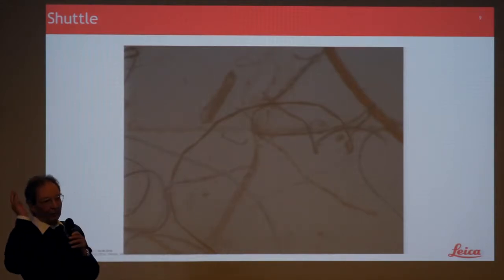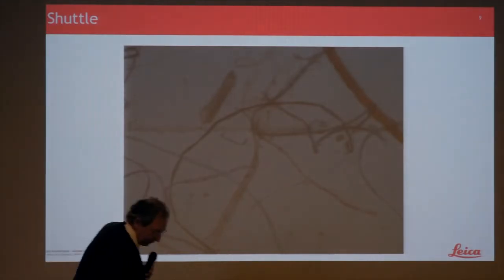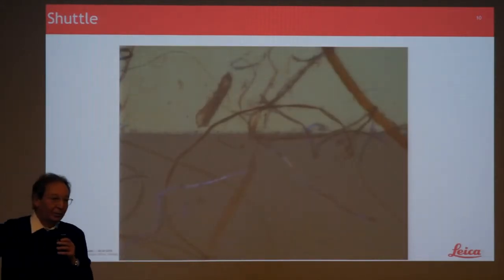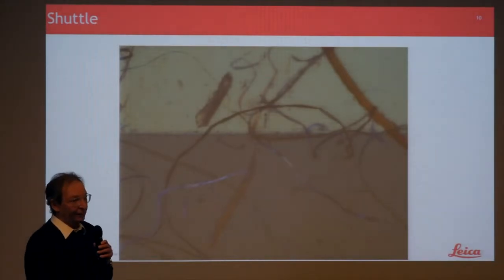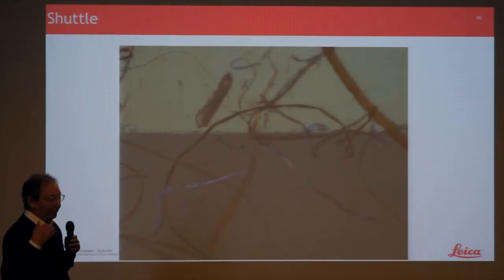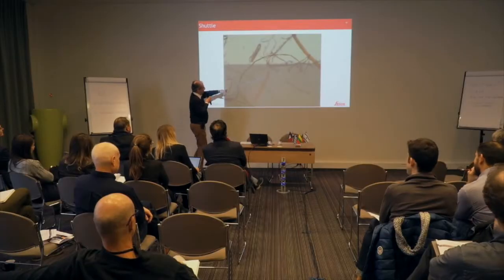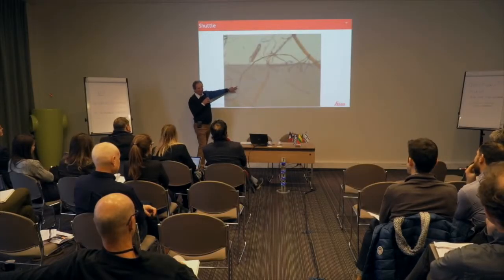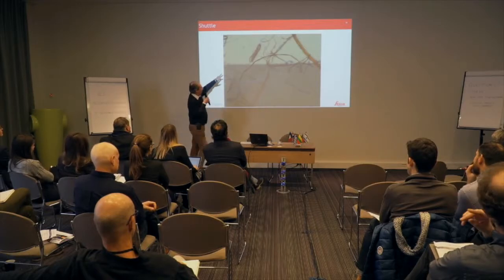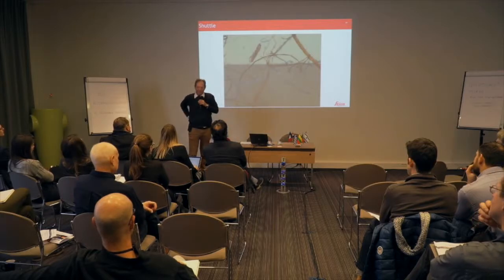And this is done without polarization. So this is just simple transmitted light. This is now with a pol foil underneath the sample and cross-polarized light. And we are on the boundary between where the foil is, the tape is. So this darker background part is where there is no tape. And the yellowish background part is the part where the tape is.